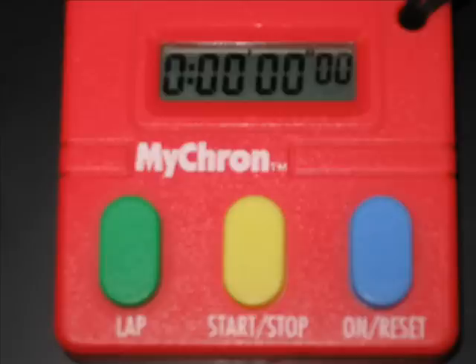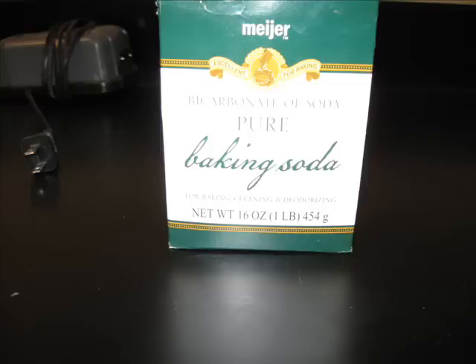We will be using stopwatches in this lab. You turn them on by hitting the blue button. You start and stop them with the yellow button. We will be adding baking soda to our plant in the test tube because baking soda adds carbon dioxide to the water, which the plant needs.